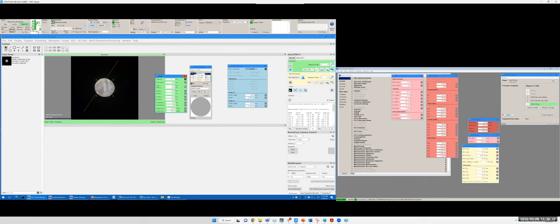You can see the Ronchigram is okay, but there are still some aberrations. That's fine. Now because we are fresh on this 100 kV mode, we not only want to measure the probe aberration again, we also want to measure the aberration in the monochromator a little bit. Although we don't need to do phonon stuff, we also want to measure aberration. So I measured the probe aberration, then I click monochromator aberration. This is a measurement button. You click, it takes images, and then it outputs the values.